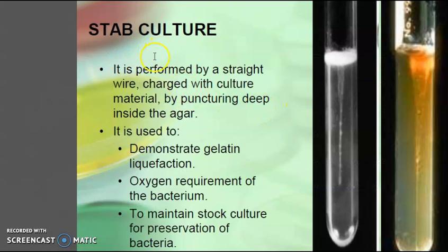Next is the stab culture. It is performed by a straight wire charged with culture material by puncturing deep inside the agar. It is used to demonstrate gelatin liquefaction, to identify the oxygen requirement of bacteria, and to maintain stock culture for the preservation of bacteria.